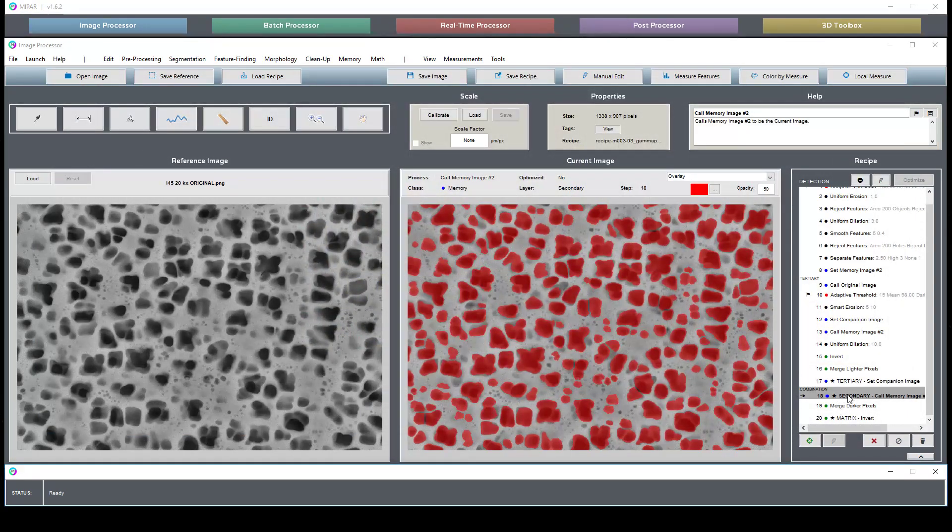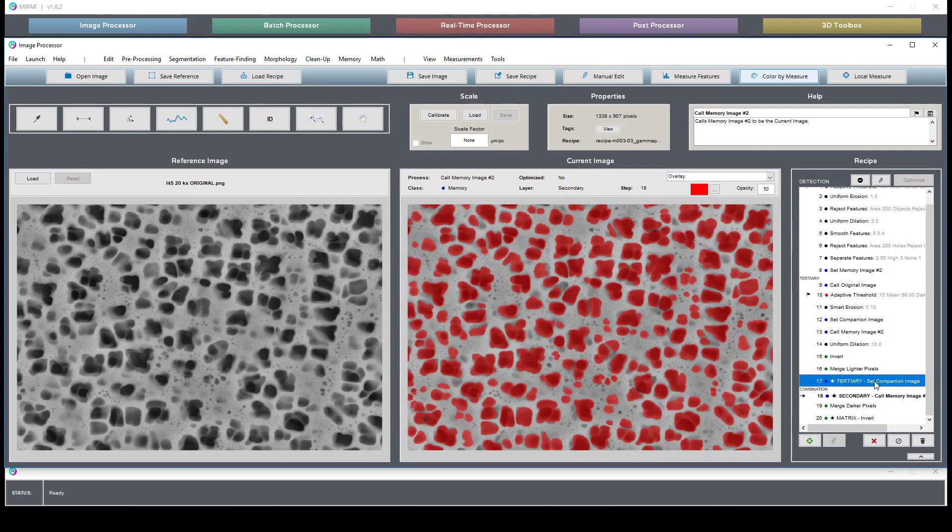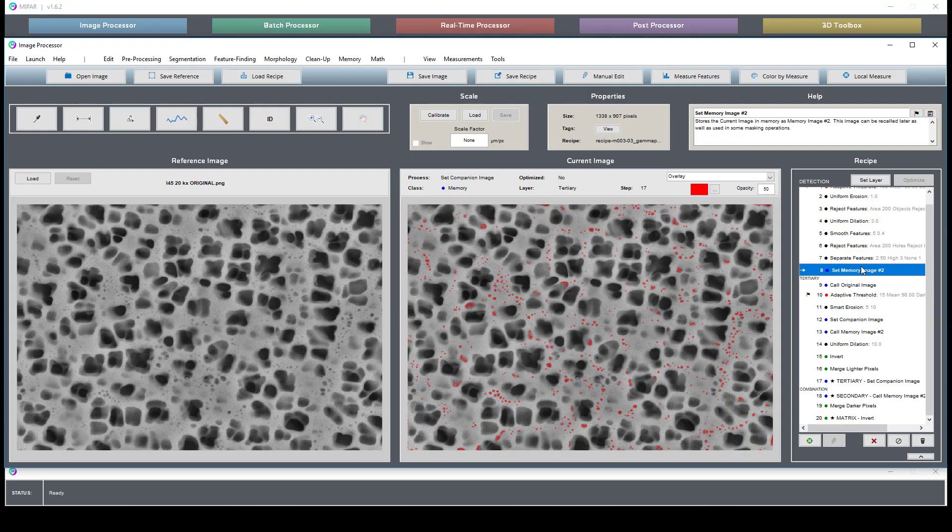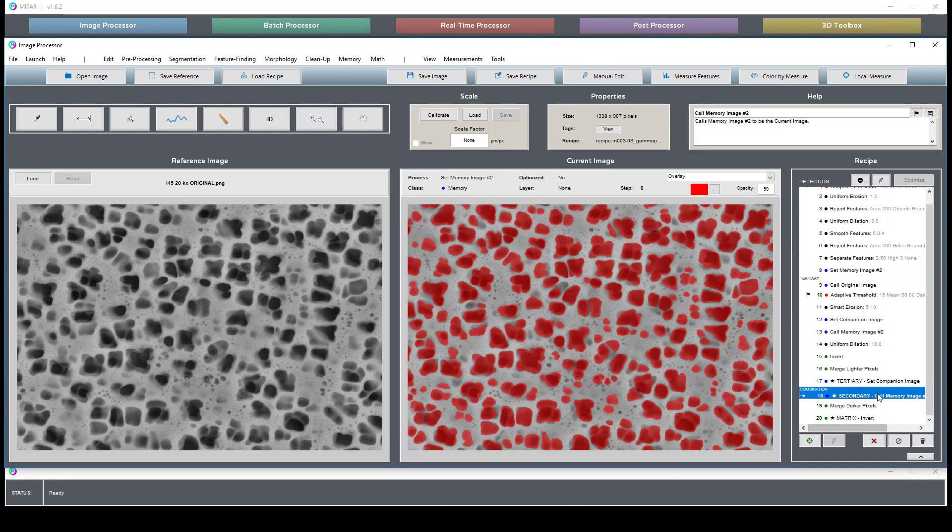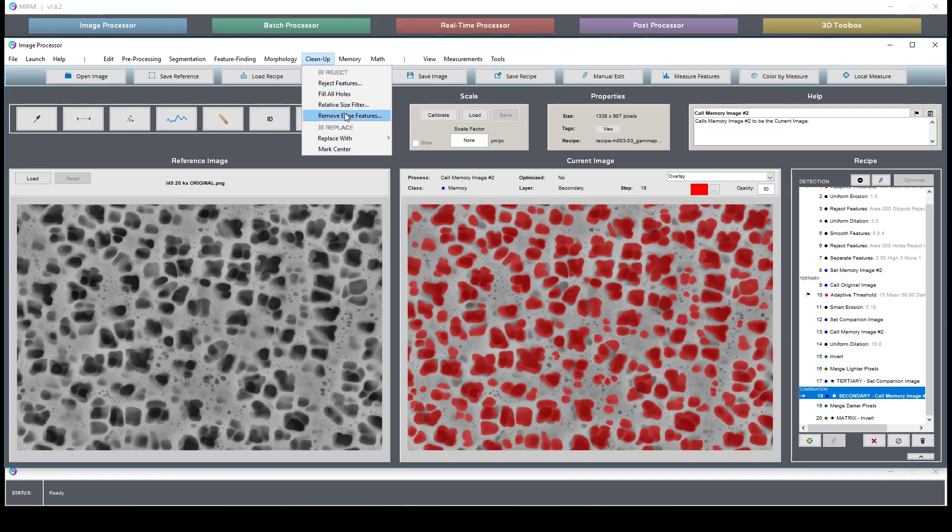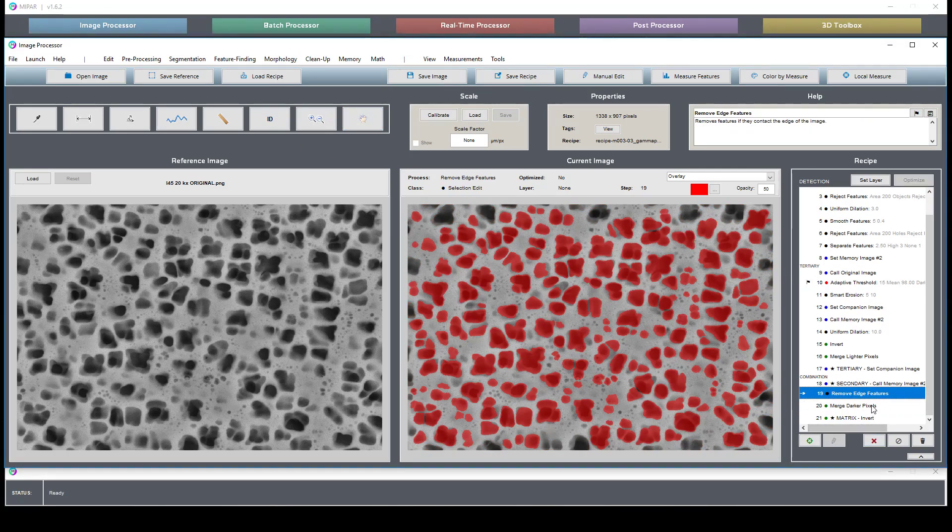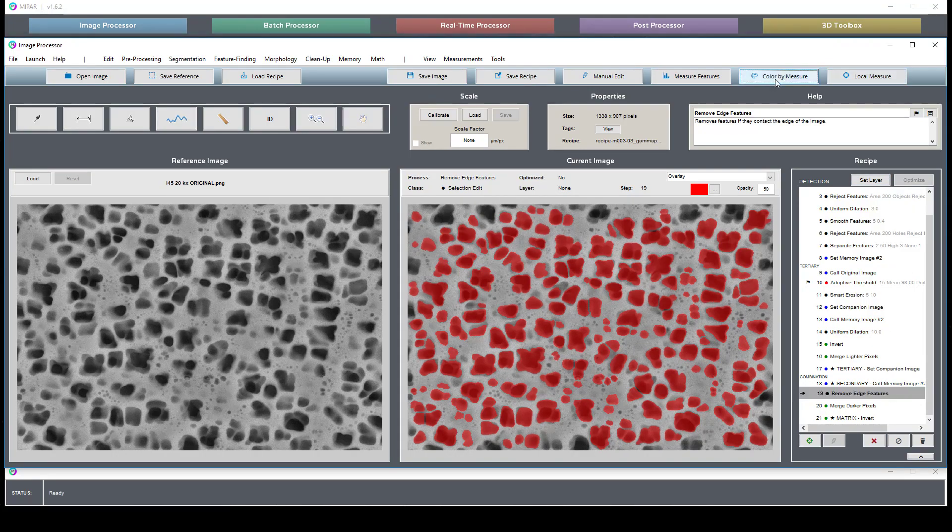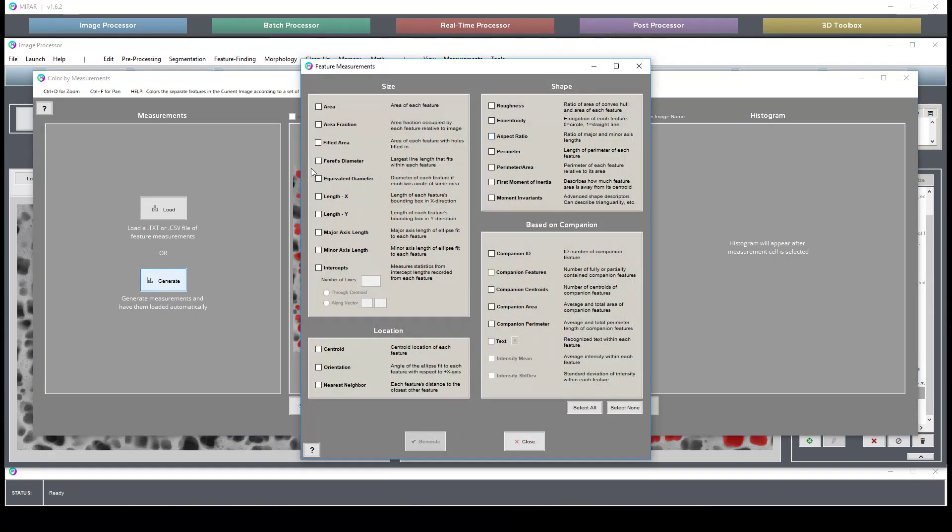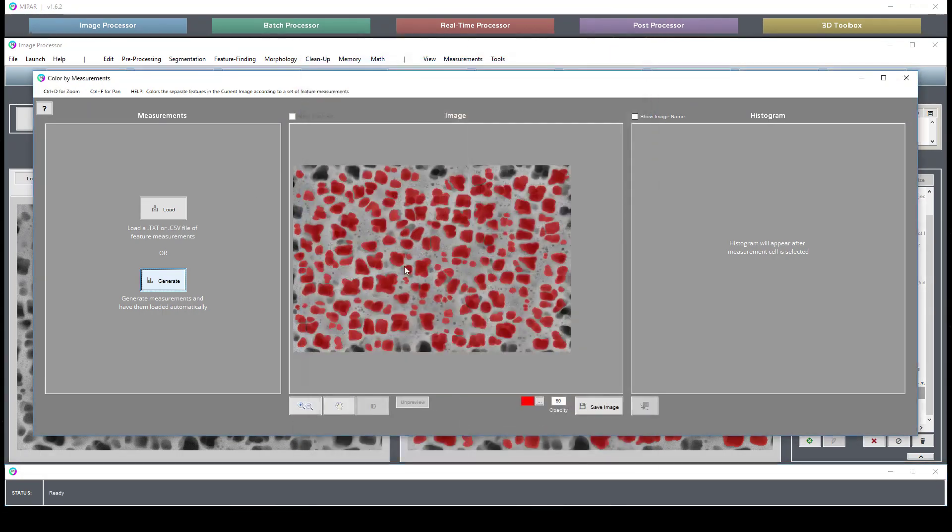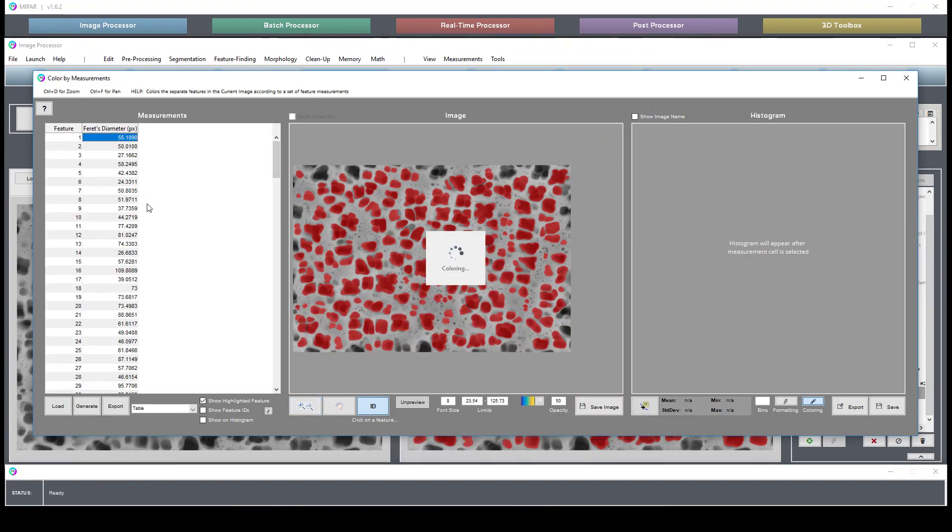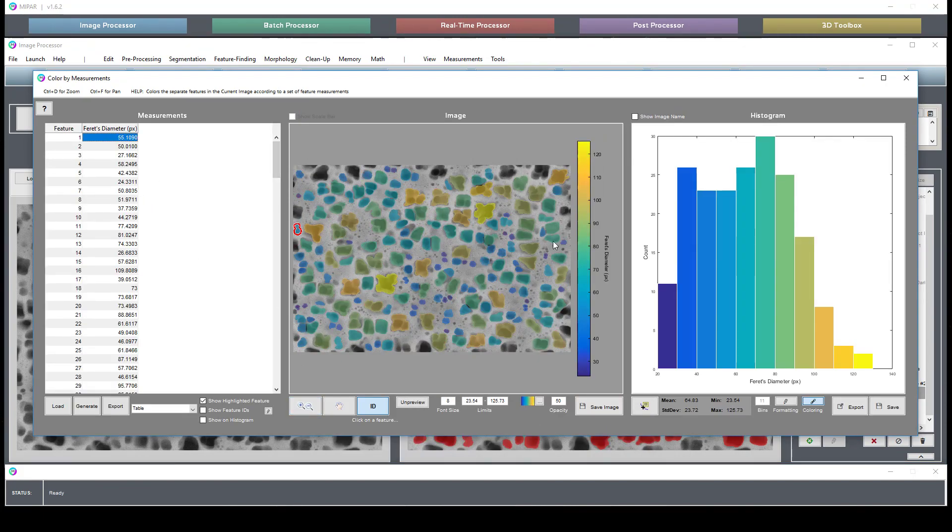Actually, I should probably remove edge features if I'm looking for the size distribution. If I measure this, the distribution is going to look a little bit different because we have removed any partial segmentation.